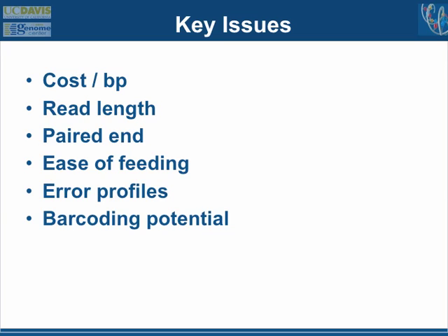Everything I'm going to talk about is in essence fluff relative to this slide. So the key thing in all the sequencing technologies you need to think about is maybe about 5 to 10 different parameters related to that sequencing technology. And really, it is impossible to keep up with the developments. Everybody thinks they're going to make $1 billion off of human genotyping in some way. And there are a huge number of companies out there developing technologies, and really, you can't keep up.